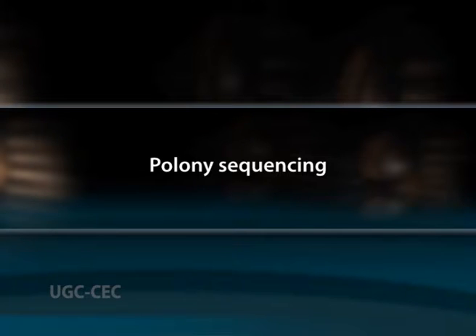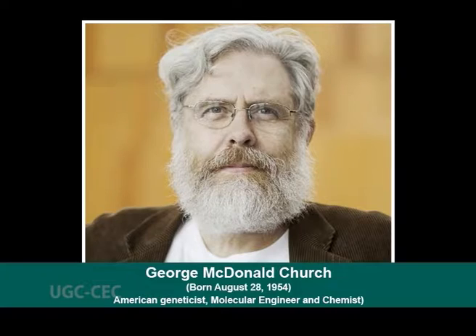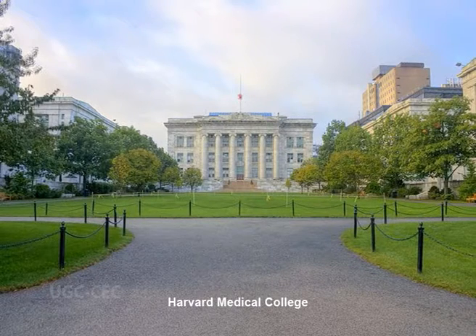Second one is Polony sequencing. It is an inexpensive multiplex method with high accuracy and is used to read millions of immobilized DNA sequences in parallel. This technique was developed by Dr. George Church in Harvard Medical College.